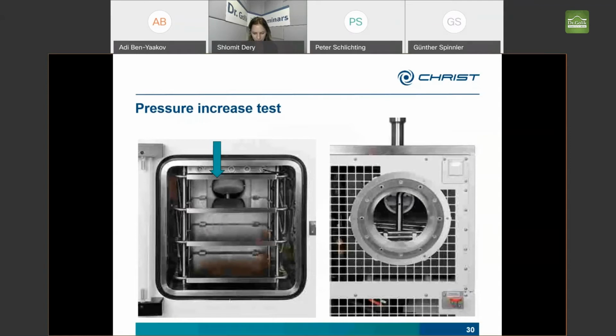Normally the wireless sensors had a separate SCADA. Now there are lyophilizers where we need to support the wireless and the wired sensors working together. We want more sensors than are supplied. So is it possible to add the graphics in the same screen so that it will be shown in the SCADA?